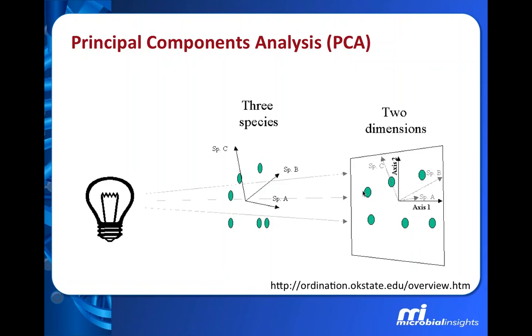Okay, so with PCA analysis, as I mentioned previously, we're going to take each of our variables, and each genus detected in our sample is a variable. So in one sample alone, we can have 50 to 100 different variables that are detected. And then you think we could have 5, 10, maybe more samples. So it's a lot of variables to try to conceptualize.